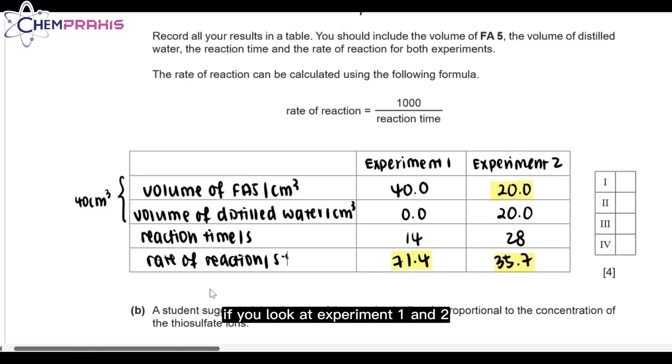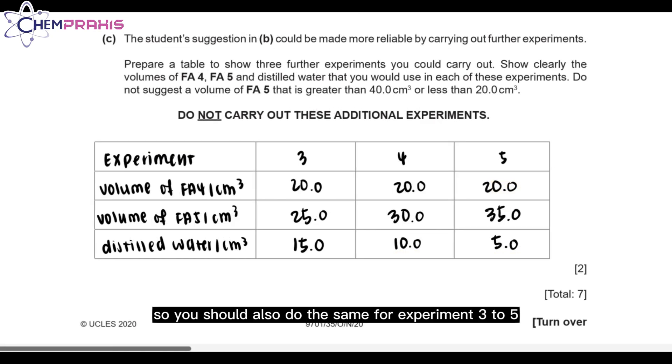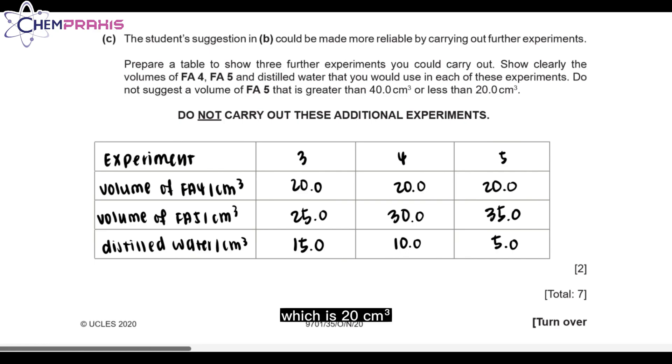If you look at experiment 1 and 2, the sum of the volume of FA5 and distilled water is always 40 cm³. So you should also do the same for experiments 3 to 5. The volume of FA4 will still remain constant, which is 20 cm³.